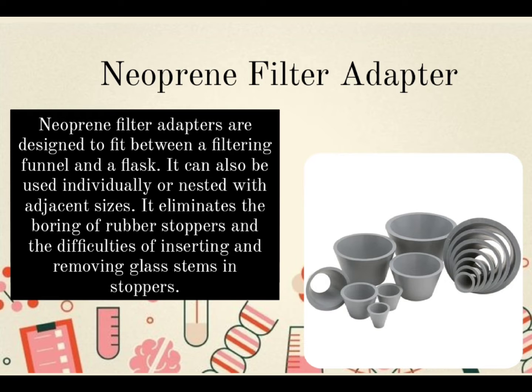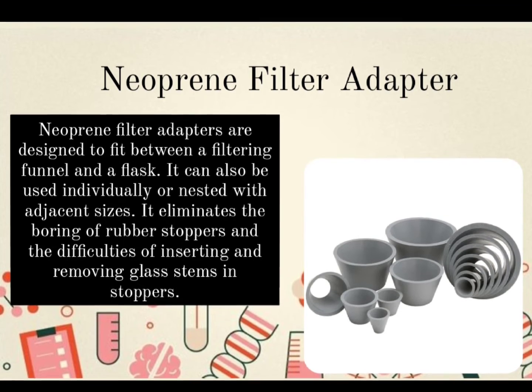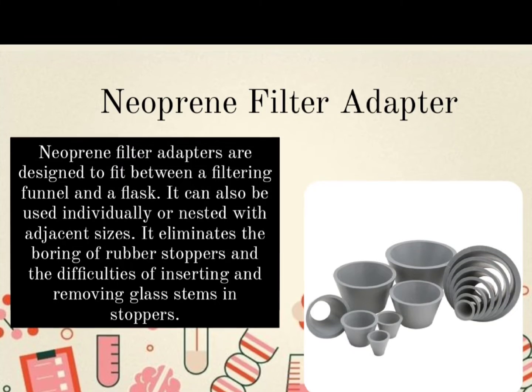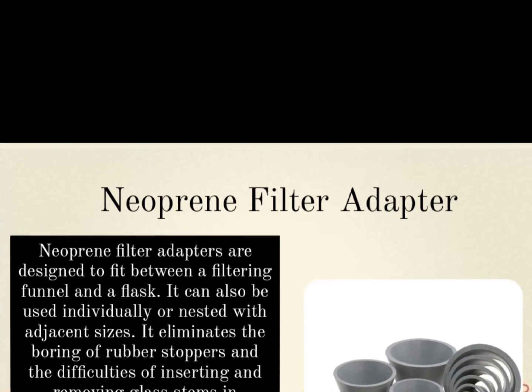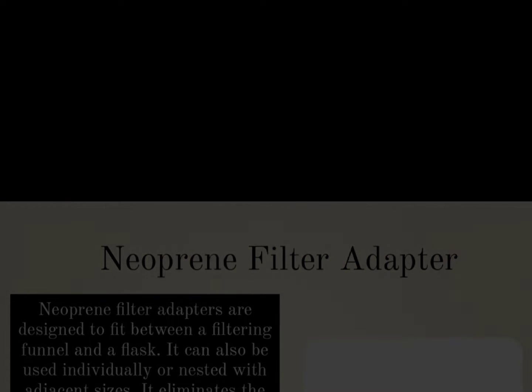Neoprene filter adapters are designed to fit between a filtering funnel and a flask. They can also be used individually or nested with adjacent sizes. They eliminate the boring of rubber stoppers and the difficulties of inserting and removing glass stems in stoppers.